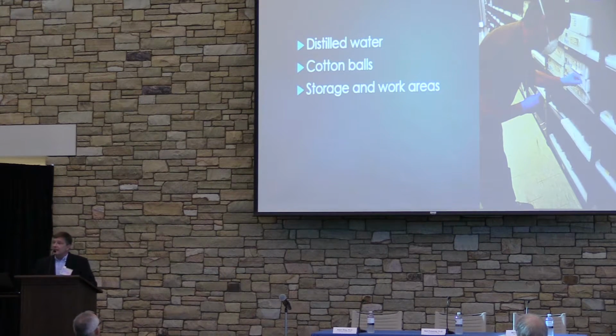We also did the contamination sampling. We collected samples from shelves, from desks, from the photo room, everywhere we could find. And we collected them in two ways. One, just by squirting water on the shelf and sucking it back up and capturing dust that way, and also by taking a cotton ball. The weird thing is that we've discovered cotton balls contain caffeine. Who knew? So contaminating your contamination samples. So we collected both ways.